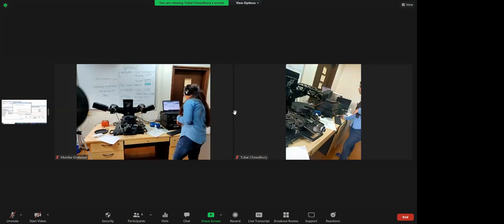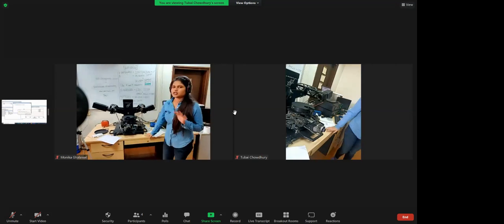We are just fitting whatever the k value of that sample will be in that model. We will not assign k value as 0 if you are not doing point by point. In that case also, if you assign k equals to 0, depending on your sample, it will fit and give you non-zero values of k. Okay, so you are saying we can start with 0, but it will give my actual value. Yes, it's just a start, because theoretically k equals to 0. So for that reason we just provide reference that k should be nearly 0.